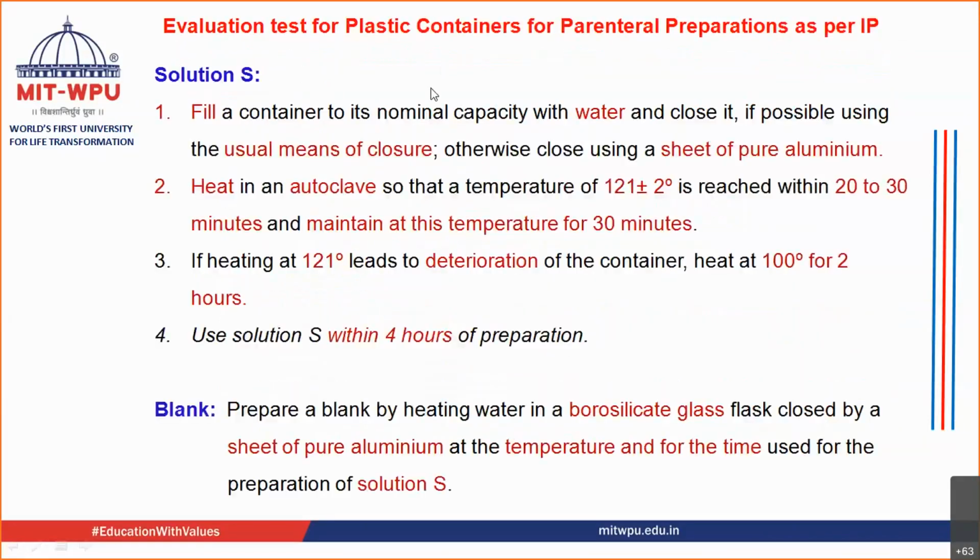Moving ahead, in order to carry out further tests, we have to prepare a solution. We are going to call this solution solution S. So how do we prepare solution S? In order to prepare solution S, we fill the container under test to nominal capacity with water. You are going to close it with the closure by which you are going to close the final container.